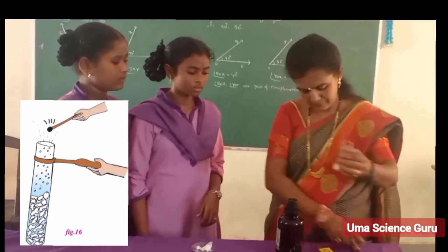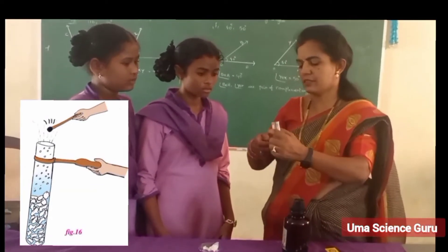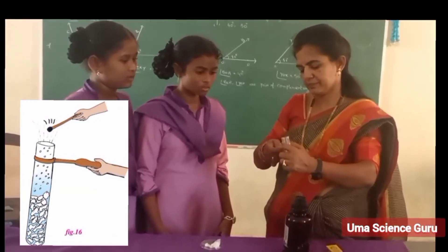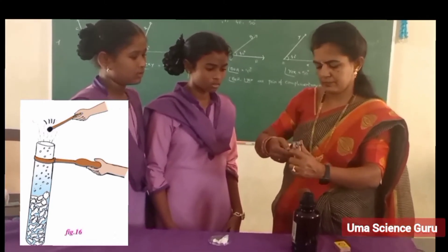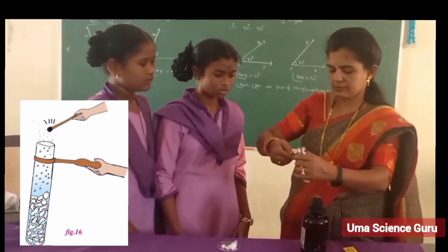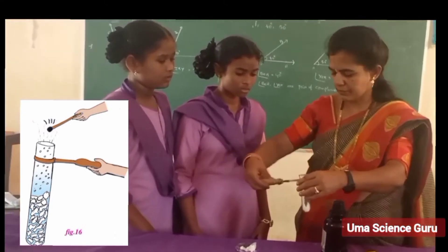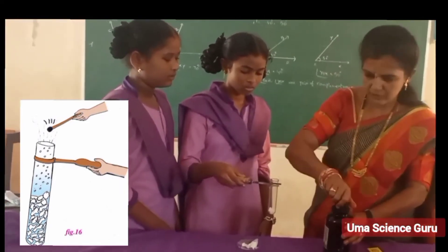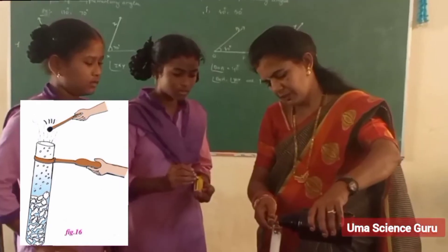Use the test tube holder to hold the test tube. Now pour the diluted hydrochloric acid into the test tube until the eggshells completely sink.